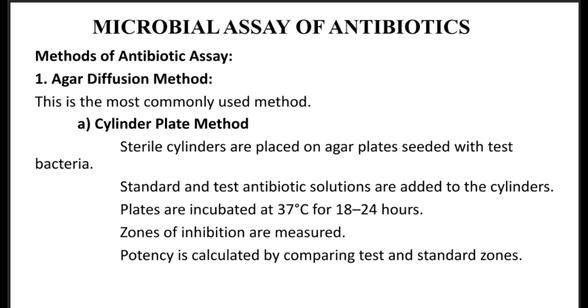Method of antibiotic assay. Agar diffusion method. This is the most commonly used method. Cylindrical plate method. Sterile cylinders are placed on the agar plate seeded with test bacteria. Standard and test antibiotic solution are added to the cylinders.